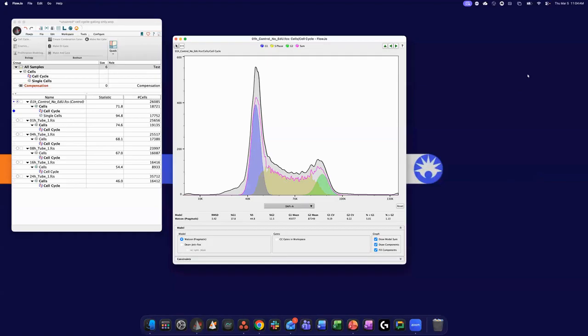I'll also add that I'm not an expert in cell cycle assays, right? I've helped users with the analysis. The assays are not something I have a lot of direct experience with. But those webinars I directed everyone to at the end might lend a little more support on that. But I'm also just a little unclear on what the question is. So if you want to elaborate, I can do my best.